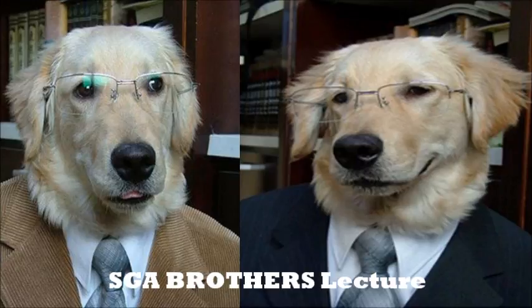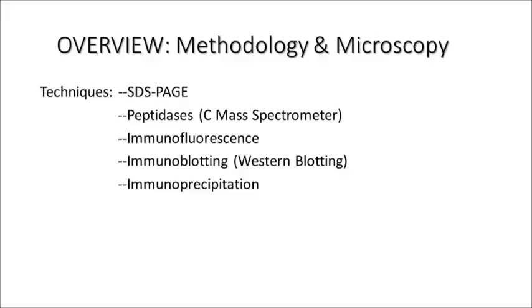I'm going to be talking about stuff. Well, more specifically, cell bio stuff, and basically the methodologies and microscopy techniques that are used. The techniques first of all.